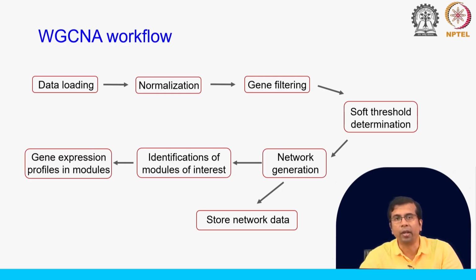We will also do something called variance stabilization. Okay. So, this is something that is also important, right. So, for example, the genes that are lowly expressed, they often show very high variance. Okay. It has nothing to do with actual variance, it is something because the genes that are lowly expressed, the effect of sampling is much higher, much stronger in those cases.